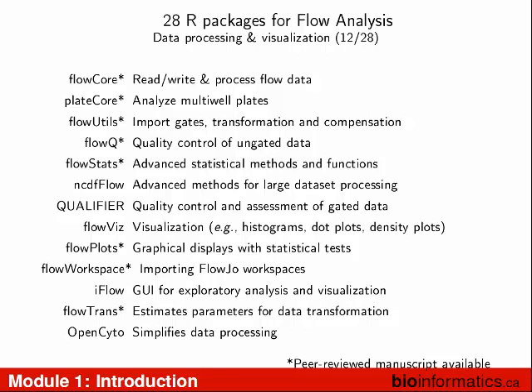You don't have supercomputers. Computers are very powerful, but it's not going to be able to churn through 466 samples of 13 colors with 400,000 events. It can't be done. But with some tools like ncdfFlow, you can have all your data sitting on disk, but it doesn't have to read the whole thing into RAM. You run into issues when you try to read too much stuff into RAM at once, big data files, and your computer will just clog down, and it's swapping, and it's not going to run fast. But if you're doing large data analysis using ncdfFlow, you can leave your stuff on disk and only read in little bits and snippets at a time. So that works really well.